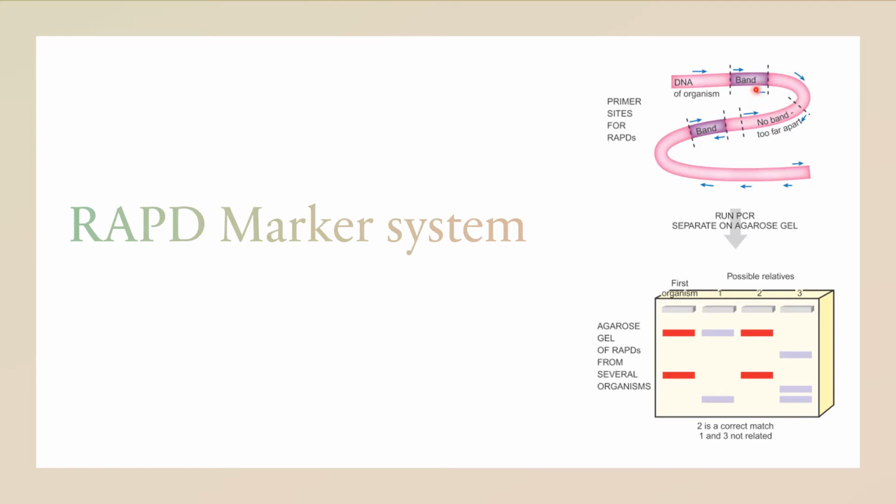Whenever it has a pairing to the DNA, to the genetic background, then it will pair, and the amplification will start to happen when it has both reverse and forward primers at that specific location, when they are not too far apart. If it binds somewhere that is too far, then it will not form any amplification. The size has to be just nice enough for amplification.